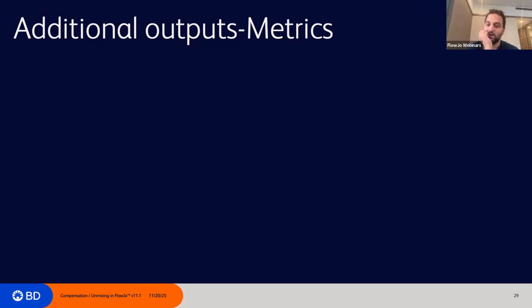But it's a good idea, maybe if we could have it as the default. But of course, I know computationally it takes a lot of effort to do this optimization. That's the only reason I wouldn't mix in FlowJo. Okay, that's feedback accepted. Thank you.